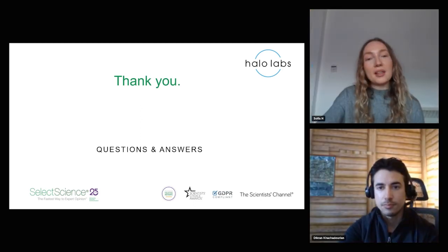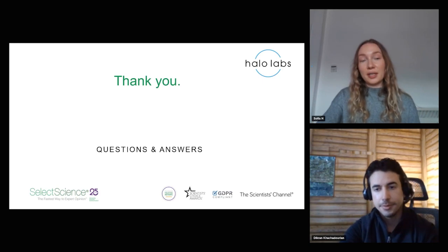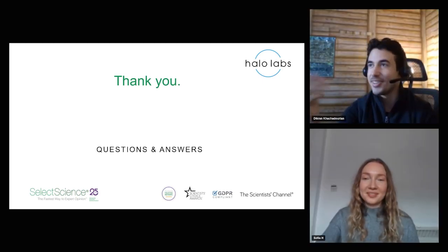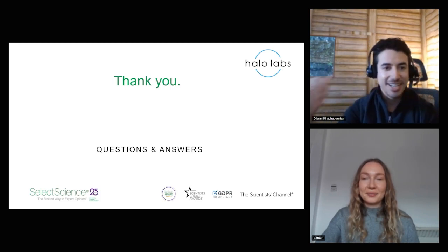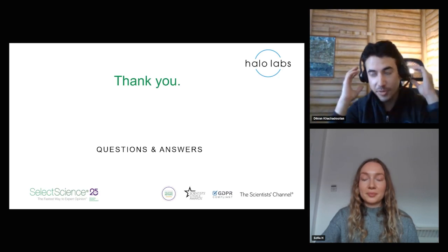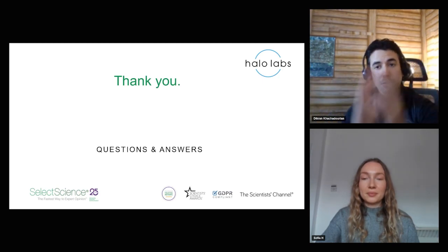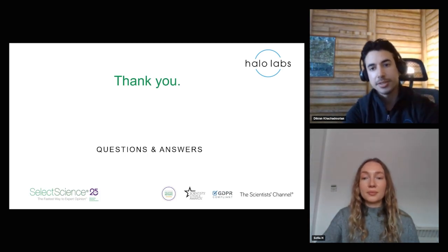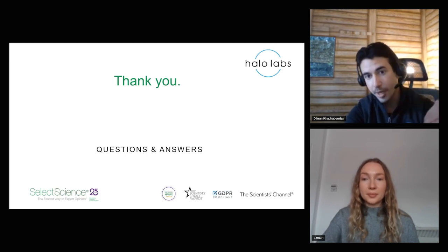What are the particle size limitations of the Aura? Yeah, another very good question. I'm sorry if I didn't mention this during the talk. That's probably what I should have started off with, but we are measuring subvisible particles. If we are looking to just count size and gather morphological information with the BMI, the size limitation is a minimum of 2 microns.